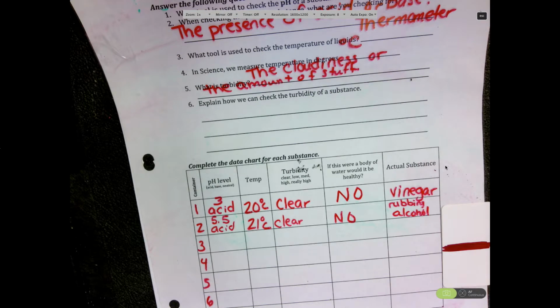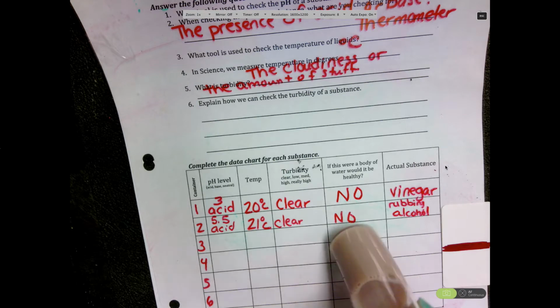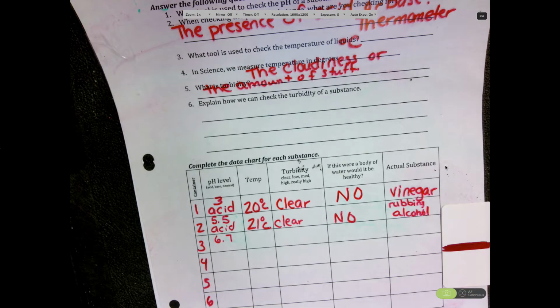All right, for our third substance, this has a pH of 6.7. First of all, is it acid, base, or neutral? Neutral.